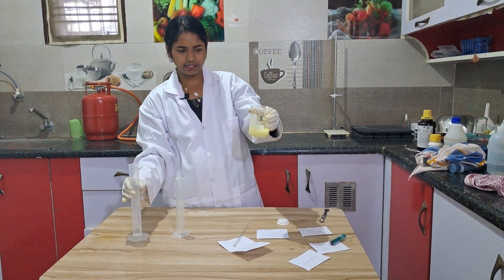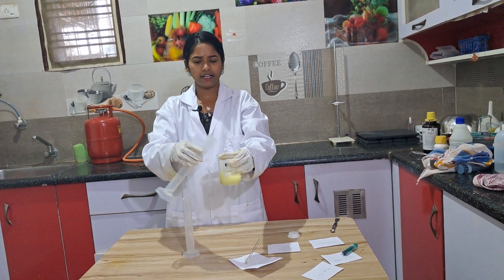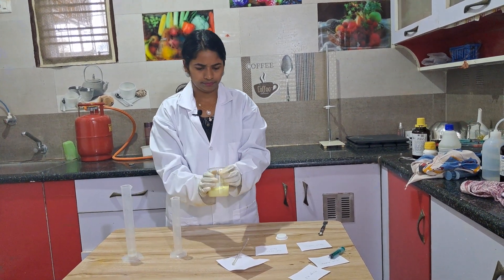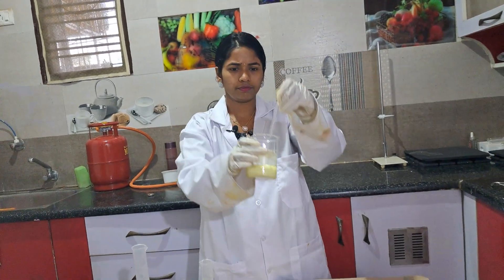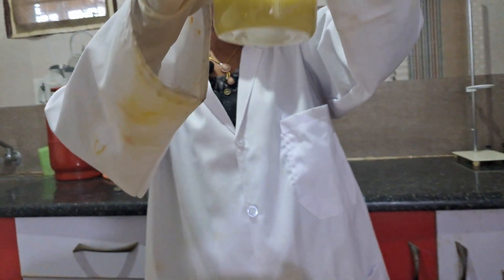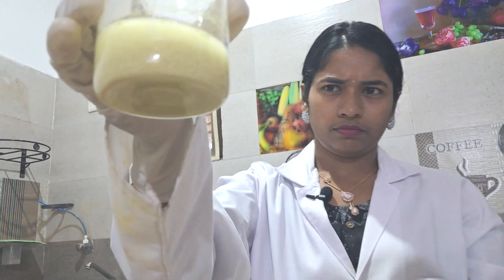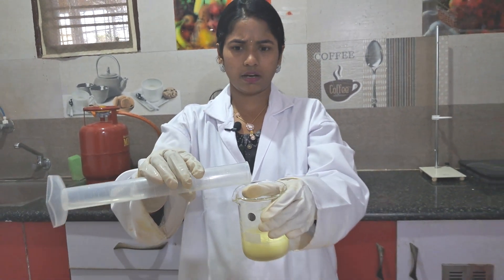See how nicely the iodiform is formed. If you leave this for some time, all the iodiform precipitate will settle down. You can see the precipitate forming already. If you leave this for some time, all this precipitate will settle down.